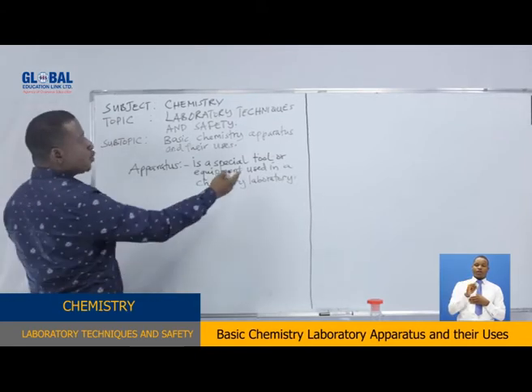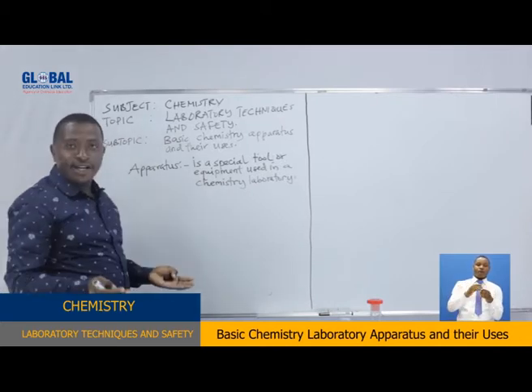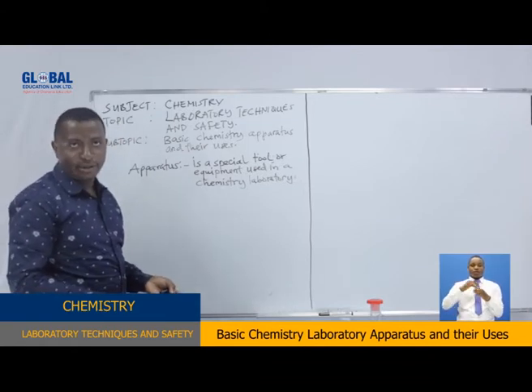Apparatus is a special tool or equipment used in a chemistry laboratory. So you can also say that apparatuses are special tools or equipments used in the laboratory.